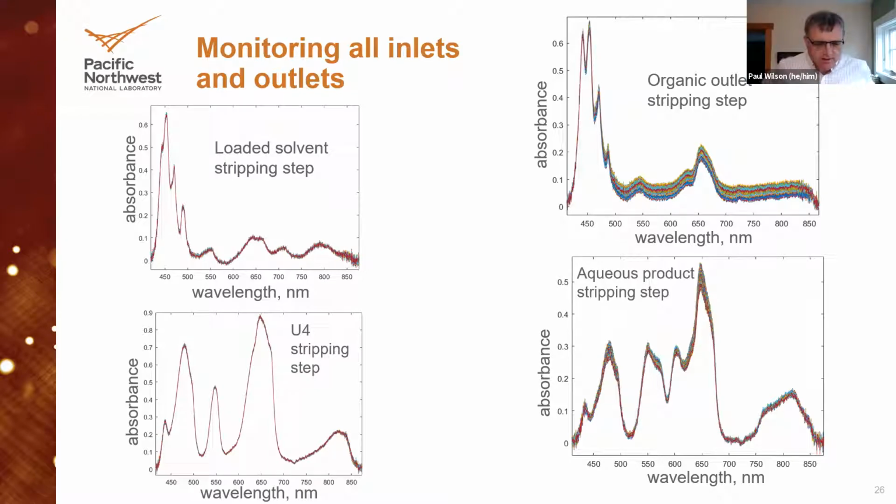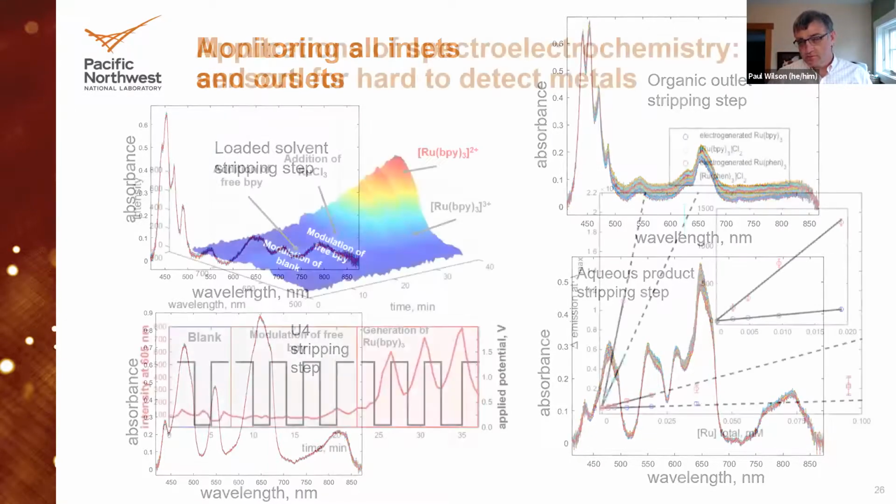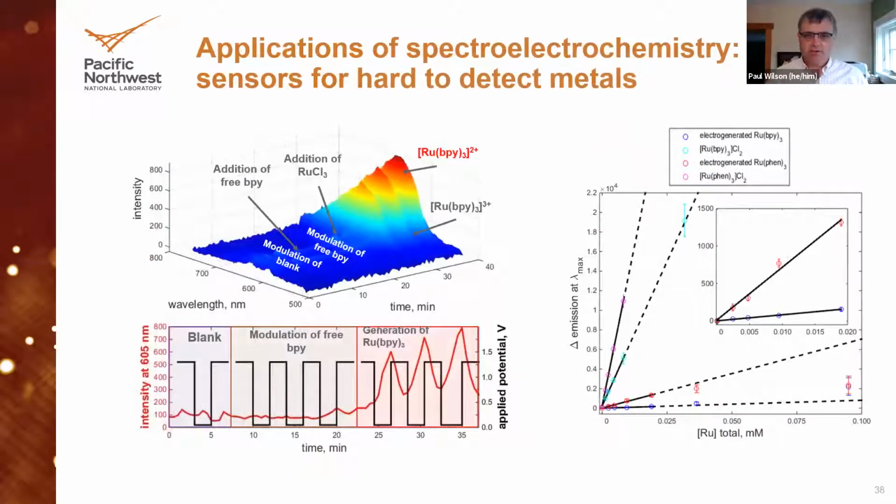So I had a question, I think on slide 38, you were talking about with the ligand and the spectroelectrochemistry, is that the right word? There we go. So the kinetics here seem to sort of affect the time resolution, if those are the right words anyway. So it looks like it's sort of minutes for these species to sort of build in and decay away. Is that sort of fundamental to this, or are there ways to accelerate that, because that would suggest your ability to measure this is within the resolution of that time frame.